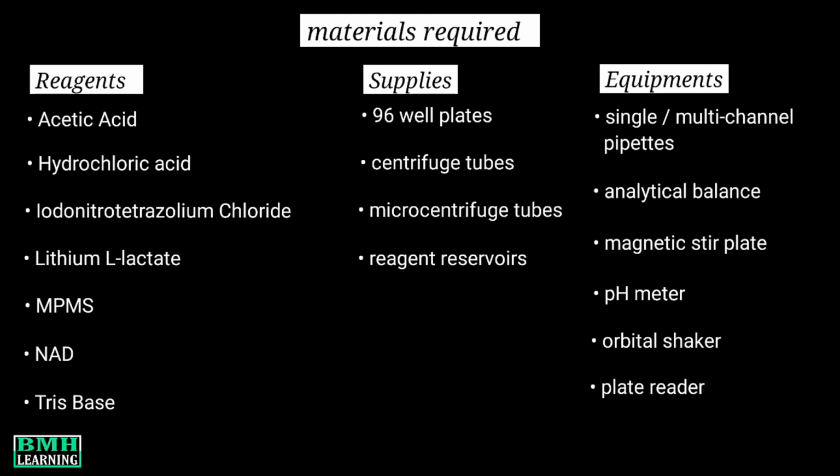Now, regarding the procedure, the protocol for the assay would depend on the type of cell lines you are working with or other experimental needs and conditions. So you can follow a certain standard protocol which you can find in research articles or some other books specifically made for biochemical tests. Or an easy alternative is the commercially available kits for the LDH assay, and you can follow and perform the protocol assays according to the manufacturer's instructions.